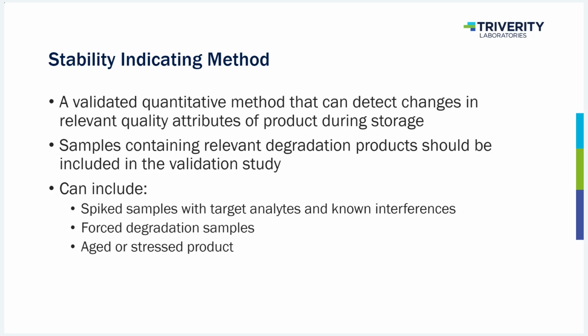When we do forced degradation, we're really hitting that with a lot of high acid content, oxidative, really high temperatures, really trying to force that degradation to show that we've got specificity of the method. Not all of those degradants are going to show up in the real world. So when you're looking at method specificity with forced degradation, you really need to take a critical eye and say which one of these might actually show up.